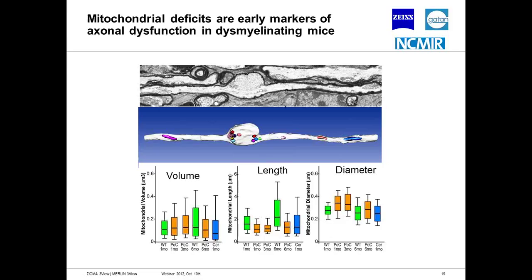And so this is a real step forward for just 3D EM in general, but especially for 3View, because it really illustrates the power of the technique, showing how easy it is. You can collect this data overnight, and then the power of how to generate meaningful statistics from these data sets.